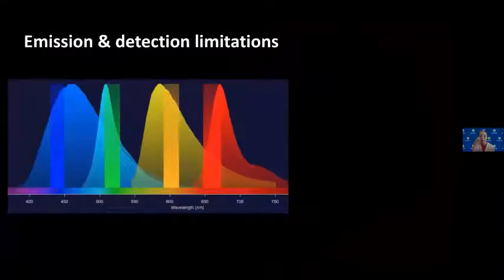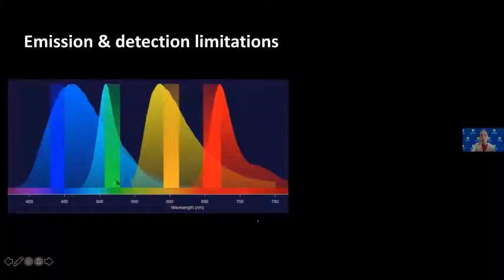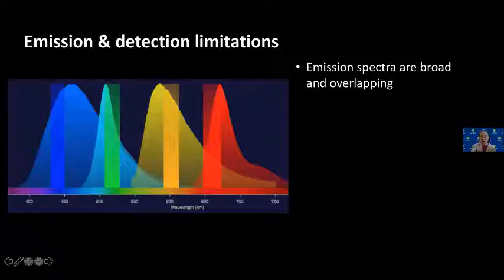So earlier I mentioned that for fluorescence microscopy, we definitely need to have a fluorescence label in the sample. Any fluorophores will have a distribution of their emission signals along the spectrum band. Here, I plotted the spectra of 4 very commonly used fluorescent dyes along the entire wavelength range. The first thing you may notice is that the emission spectrum can be very broad, and some of them can be overlapping. Also the bars I plotted are the filters in front of our detectors, which specify what wavelength band we can detect with a certain detector.